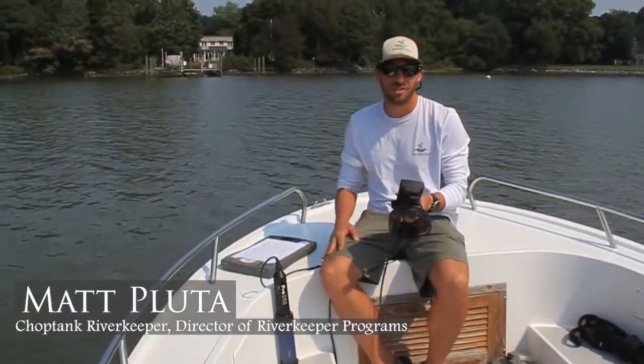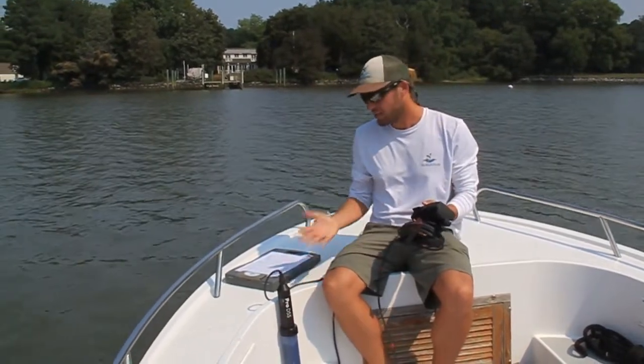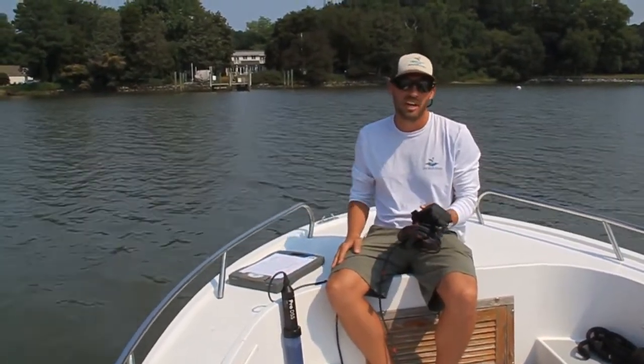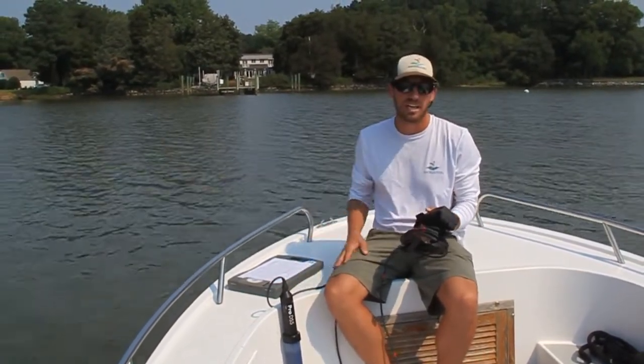I'm Matt, the Choptank Riverkeeper with Shore Rivers, and we're out here today on the Choptank River collecting water quality samples for our tidal water quality monitoring program. This is the data that we collect every year at over 200 sites throughout all of our rivers on the Eastern Shore, from the Choptank up to the Sassafras. And we use this data to inform our water quality analysis.